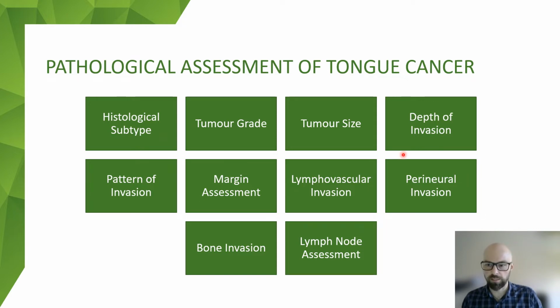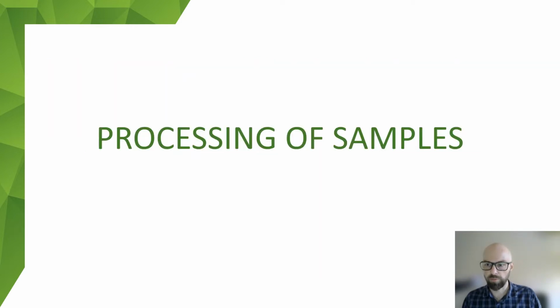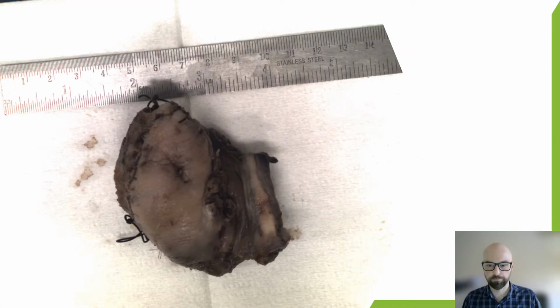In particular, depth of invasion can be really quite challenging in practice. So I'll be going into a little bit more depth of the difficulties in these assessments and how I overcome them. But before I get into that, in case there's anyone who's watching who doesn't have experience within a lab, I'll just briefly touch on how specimens are processed.